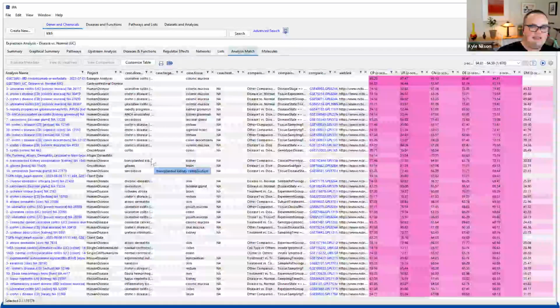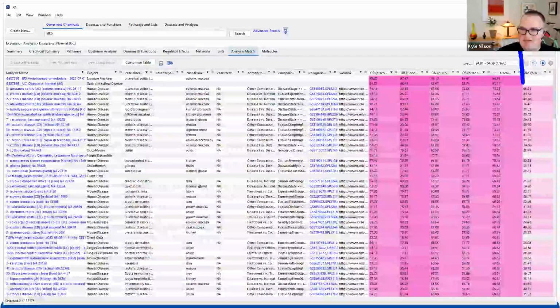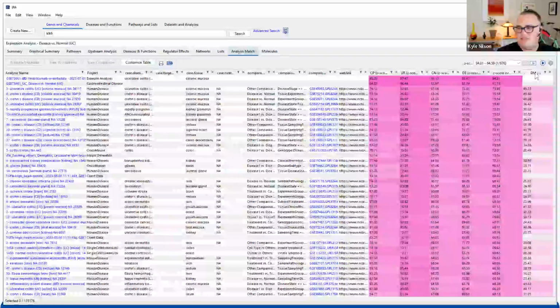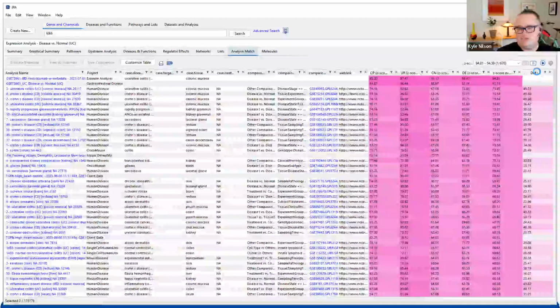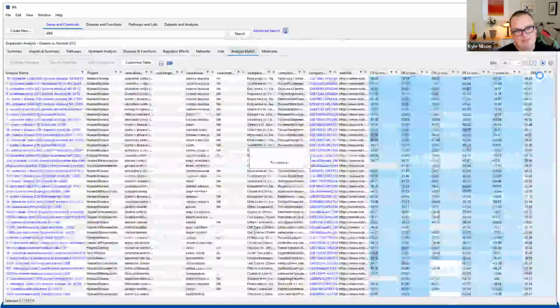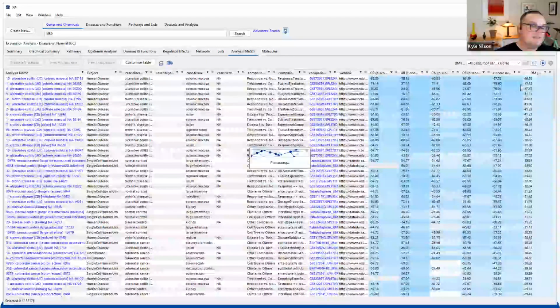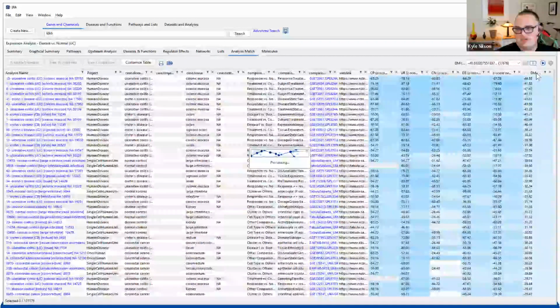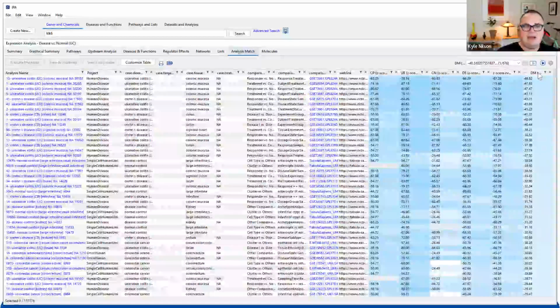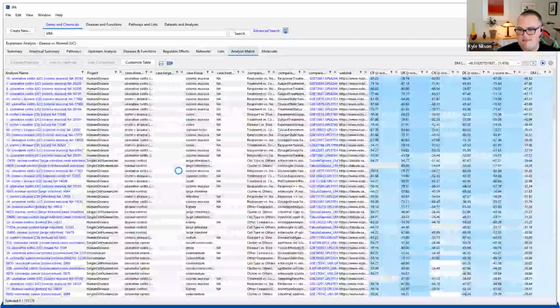And then finally, the last thing that I will show is this optional column. If we sort by this instead, this will provide a different type of matching. So rather than sorting and matching based on the signatures of your canonical pathways and upstream regulators, instead, we can simply sort by, are the genes themselves similar?